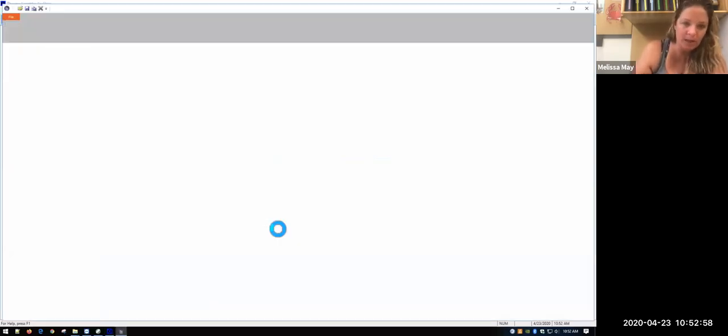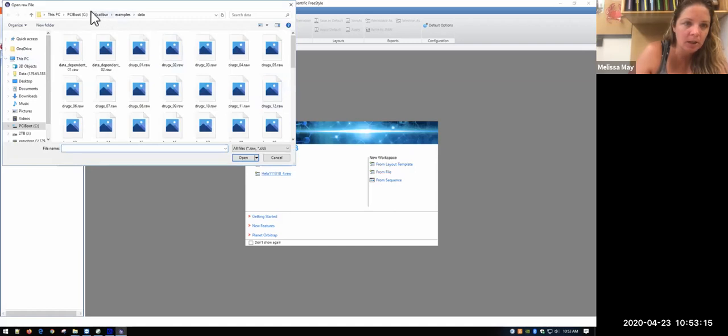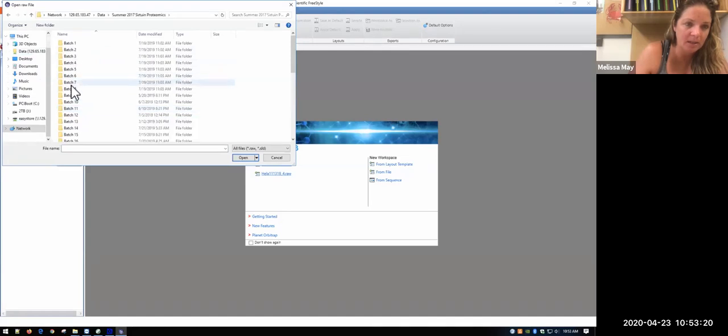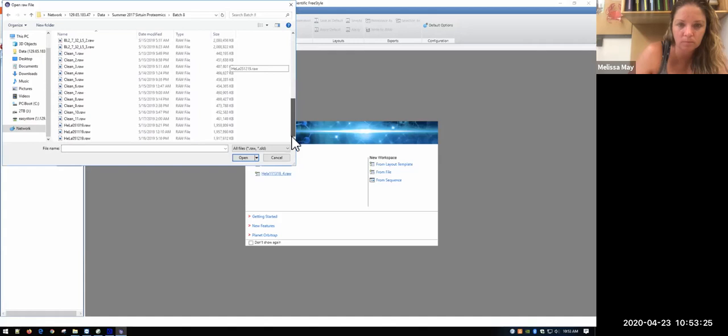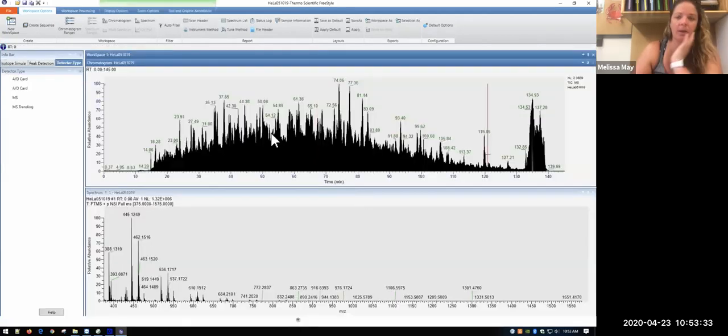When you're doing quantification, let's see if we can open this. This has some other features where you can look at the area under the curve. Oh, this might not open because I think I changed where I was keeping things. Okay, so it's similar, right?